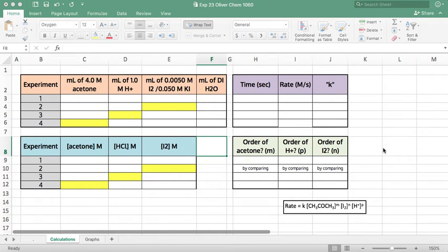All right, experiment 23 is the kinetics experiment with concentrations. So there's a lot to cover. I'm going to talk quickly, assuming that this is a video. You can pause it and rewind it, or you can put me at half speed so I go slower. So let's get started.